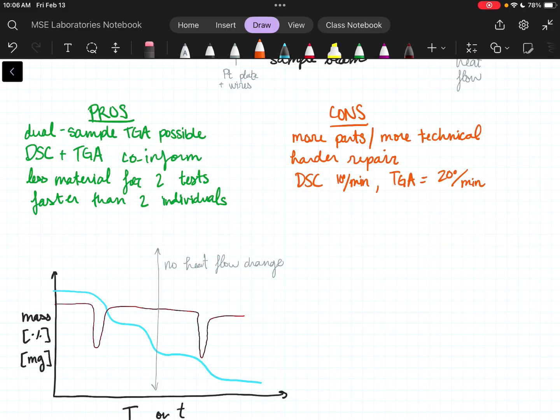Like if I were to throw an ice cube into the oven, suddenly we have an ice cube existing at 400 degrees Fahrenheit. That's not thermodynamically stable, but if I'm watching it, I'd be like, oh yeah, ice doesn't melt until past 400 degrees Fahrenheit because I've just blasted it with heat really quickly. So that is absolutely a struggle with DSC. We have to go slow enough that allows the kinetics and the change to happen. TGA doesn't tend to have as many kinetics getting in the way for the mass loss. Once mass is freed, it's like, I'm out of here.